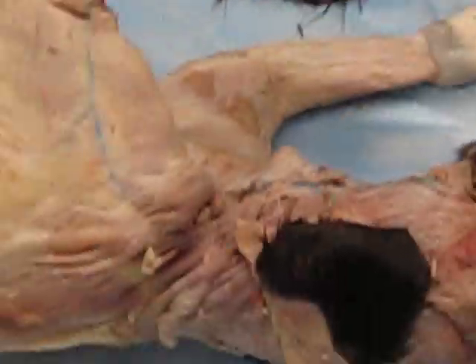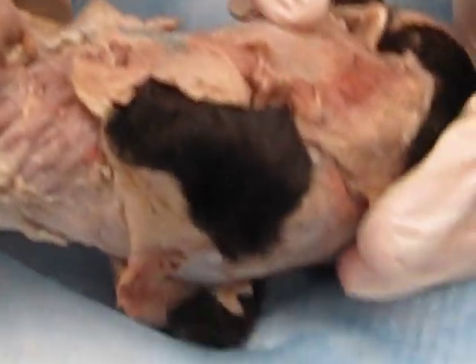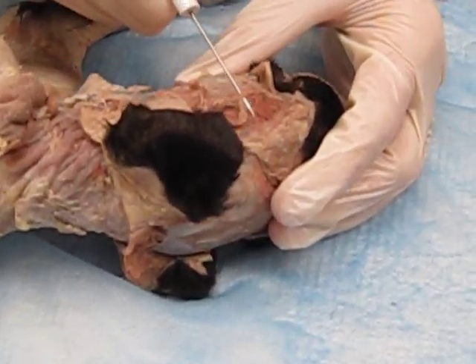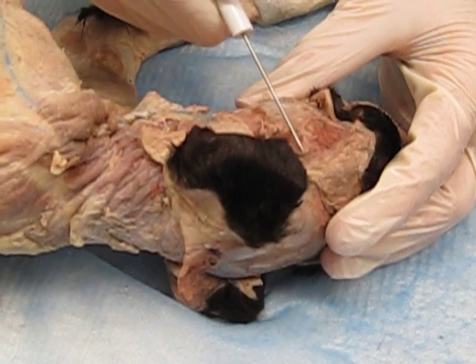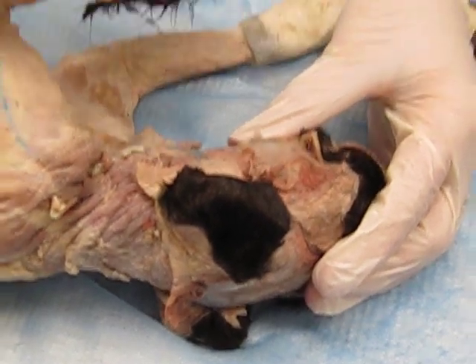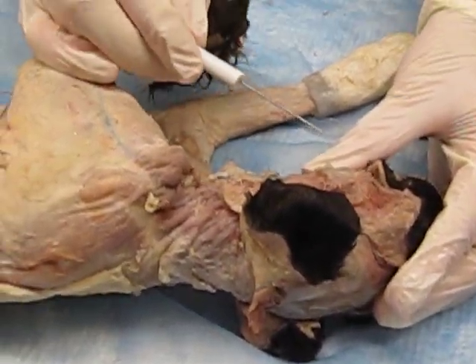Let me show you what it looks like after you reveal everything. You see I've removed that muscle and the fascia. You see that here's my facial nerve, which you can look on that page is the one on the top. And do you see it branches into a couple different sections? You can see my little branches here. Facial nerve. So what I've done is I've dissected it away and I've used a probe or the tweezers and I've lifted it off the top of the masseter so it's easy to see.